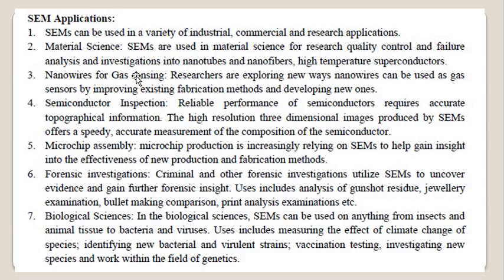So in case of material science, SEMs are used in material science for research, quality control, failure analysis, and investigation into nanotubes, nanofibers, and high temperature superconductors, which are also being studied with the help of this scanning electron microscope. Whether there is any problem related to quality or quality check, this microscope can be used.